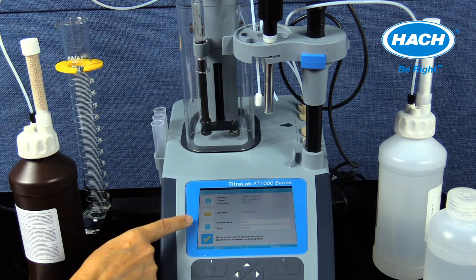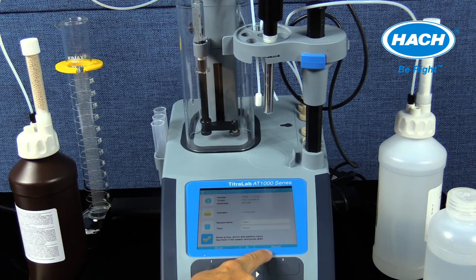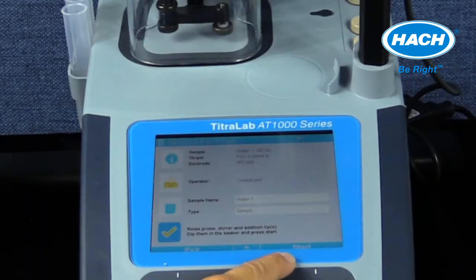The method screen displayed next will confirm the following settings for this titration procedure, which includes the correct application at the top, the information icon displaying the sample volume, titrant, electrode installed, and any operator and sample information. The check icon details a few steps to prepare before starting the titration. When ready, the titration can be started by selecting the Start soft key.